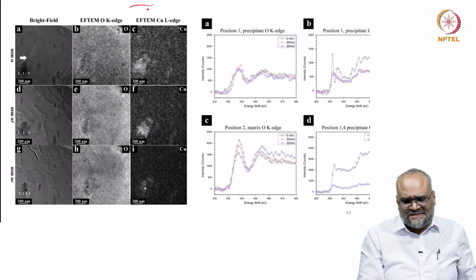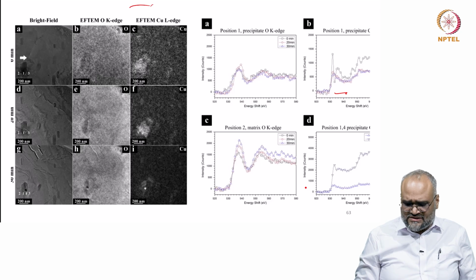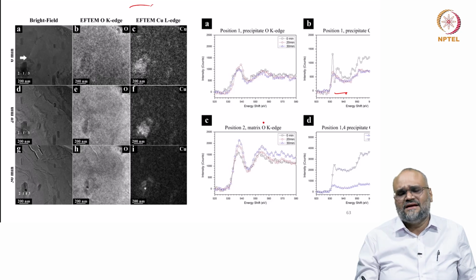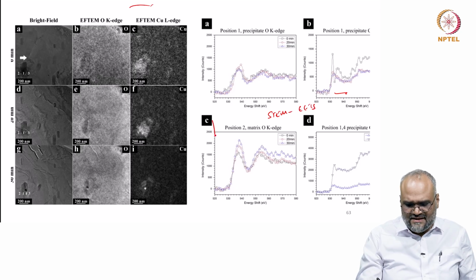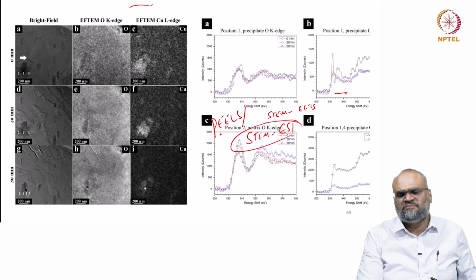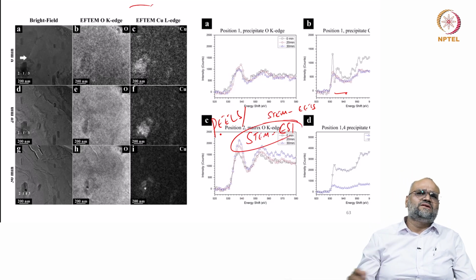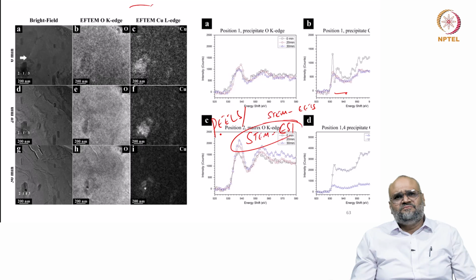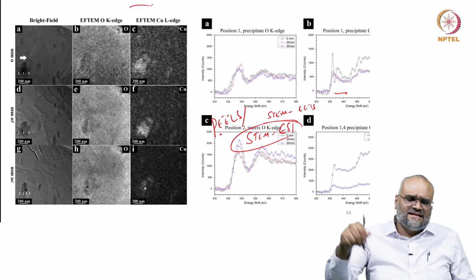And from each specific position, if I record EELS spectra like this, I can also get parallel EELS recording coupled with STEM. This is called STEM EELS, and people call this either PEELS or STEM EELS electron spectral imaging. With this, with a very good spatial resolution, you can also get the spectral information from each of the pixels where your electron beam is rastering through.